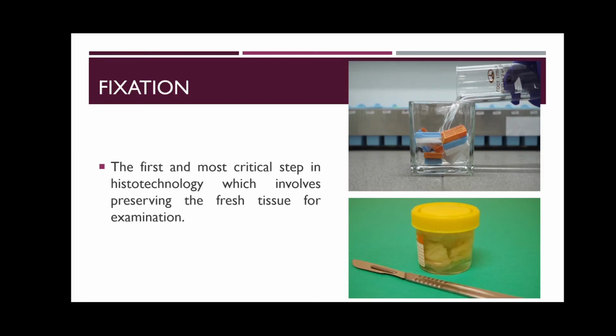The primary aim of fixation, class, is to preserve the morphology and the chemical integrity of the cell in as lifelike a manner as possible. So whatever is found in your body, with the help of fixation, this will be reflected in the slide if you properly fix your specimen.